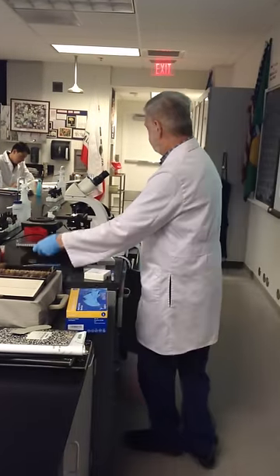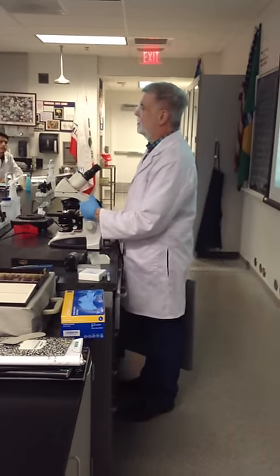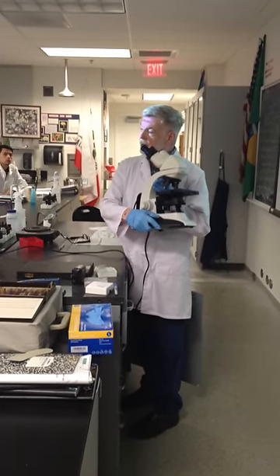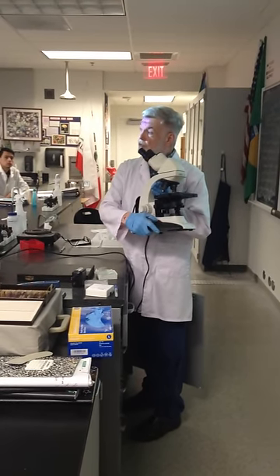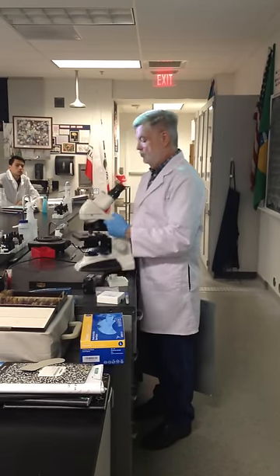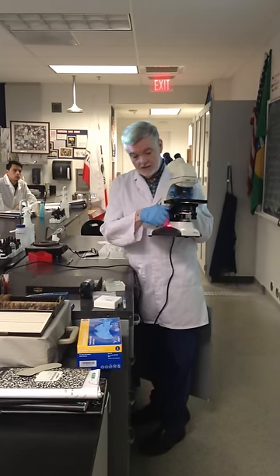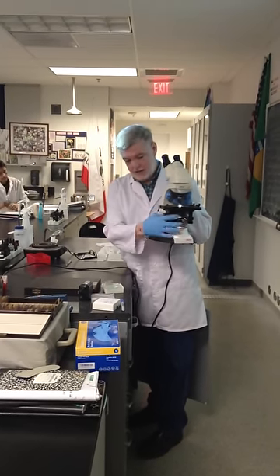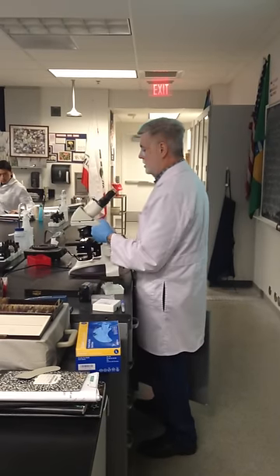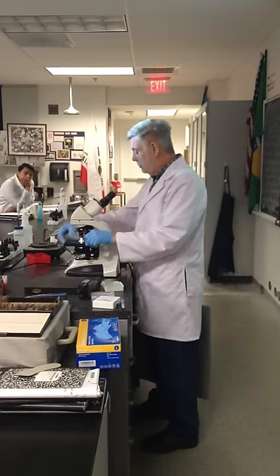Get your microscope and carry it over. First, check the round wheel — make sure it's clicked back all the way toward you. Plug it in, turn the power to 90%, then bring the condenser up and open the iris diaphragm almost fully. The stage should be down.